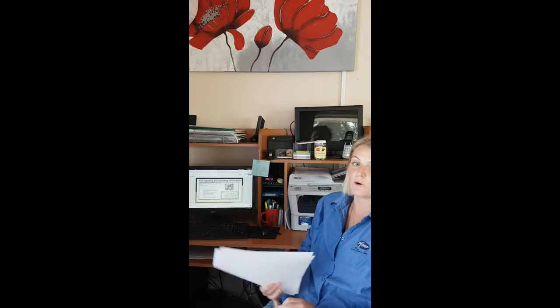Reporting and recording into the computer once results are complete. That takes us on to the next slide. So how reporting and recording will be done. So I've just put in there a wee bit on quality control. So we always want to be checking new batches of stain and reagents for correct staining reactions using a smear containing known gram-positive and gram-negative organisms.